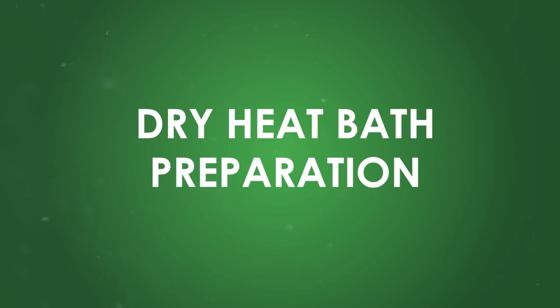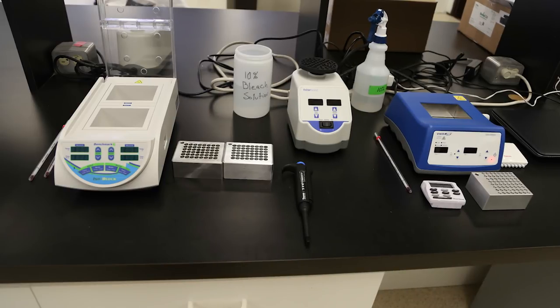Dry Heat Bath Preparation. While the reagents are adjusting to room temperature, you can set up your dry heat bath units. Follow the manufacturer's instructions for calibrating and oiling the dry heat bath units your lab uses. This video demonstrates the setup of a benchmark dual dry heat bath and a single VWR dry heat bath.